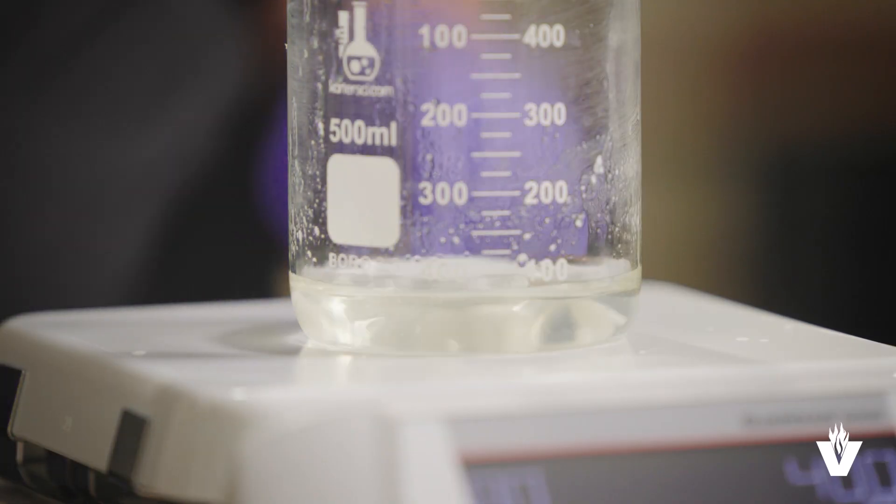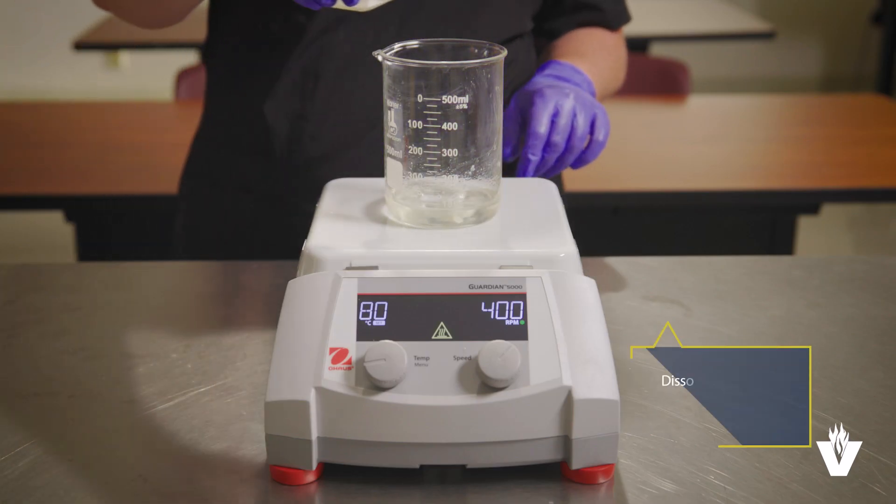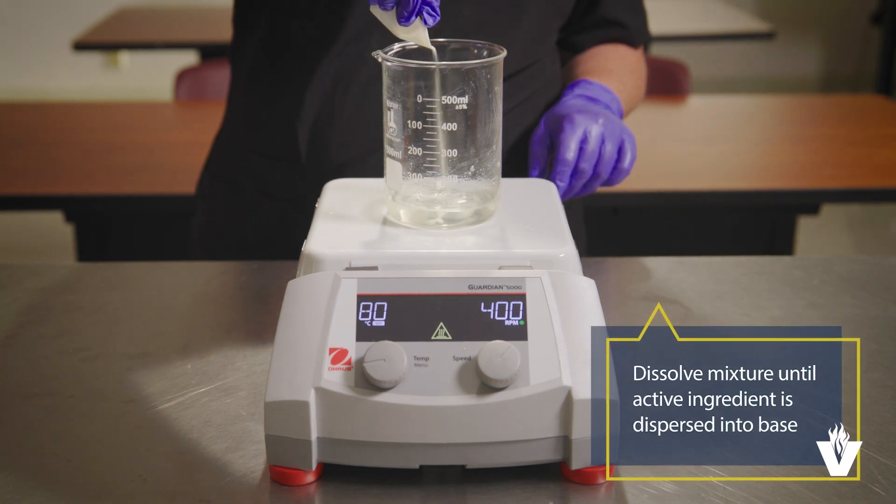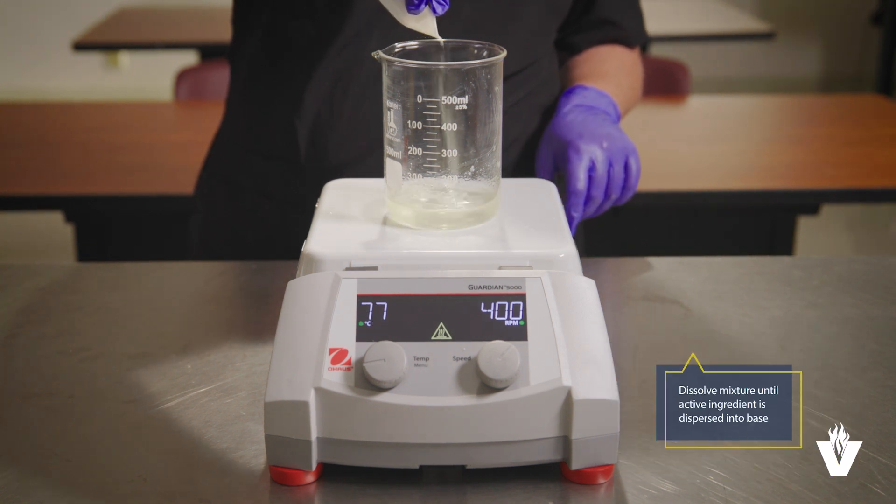Once the base ingredient is melted, add in your active ingredient powder and let the mixture stir until it dissolves and the active ingredient is dispersed in the base.